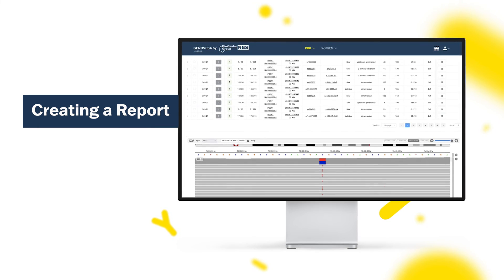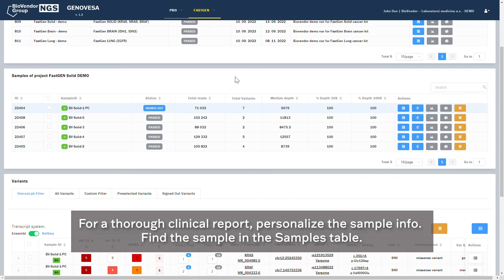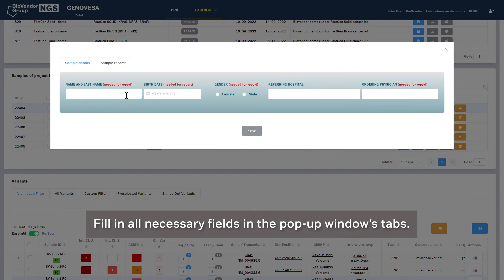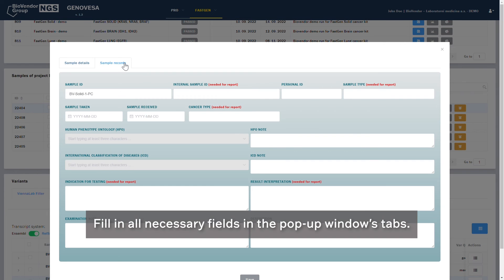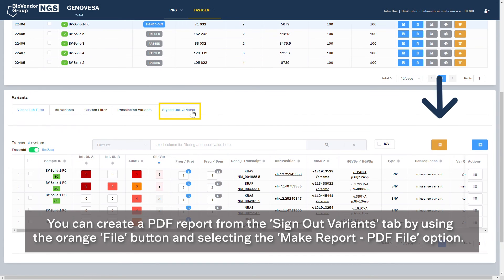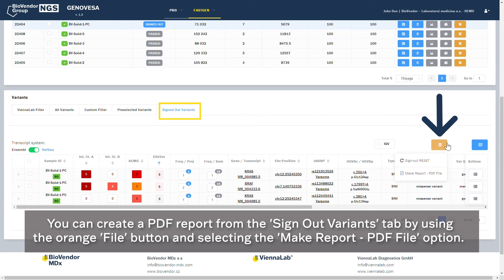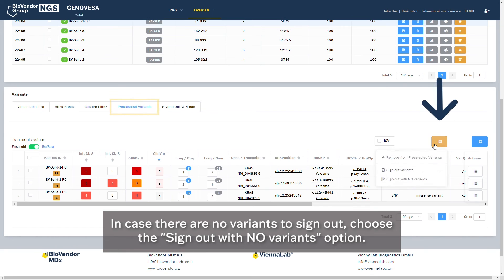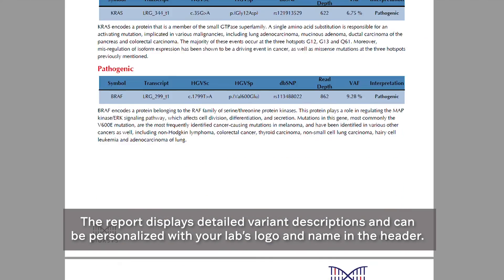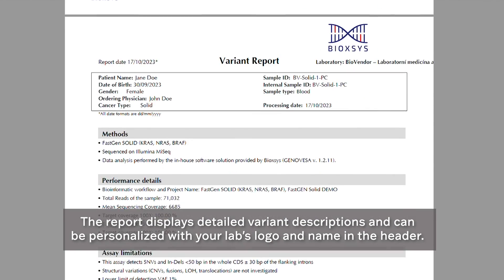Creating a Report. For a thorough clinical report, personalize the sample info. Find the sample in the samples table, click Manage Data of Examination for your chosen sample, and fill in all necessary fields in the pop-up window's tabs. You can create a PDF report from the Sign Out Variants tab by using the orange file button and selecting the Make Report PDF file option. In case there are no variants to sign out, choose the Sign Out with No Variants option. The report displays detailed variant descriptions and can be personalized with your lab's logo and name in the header.